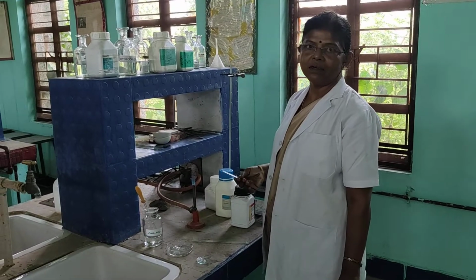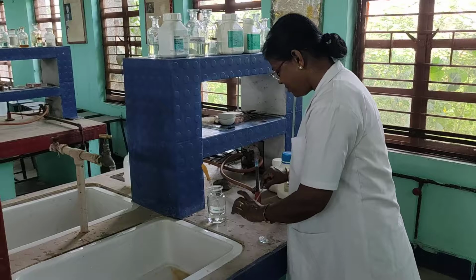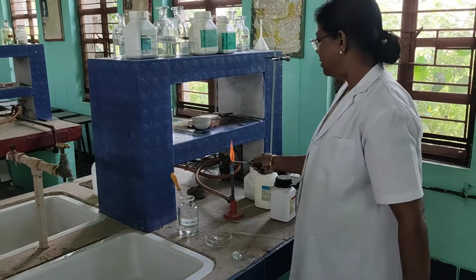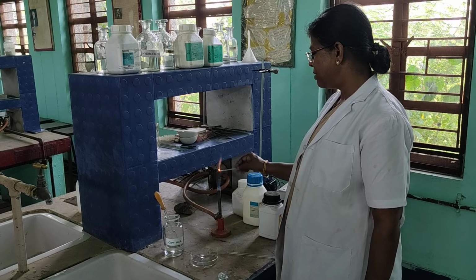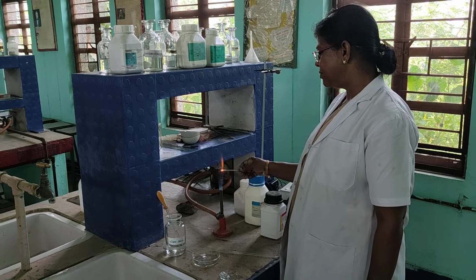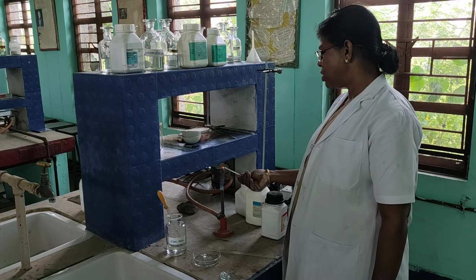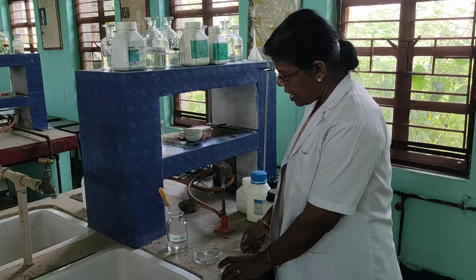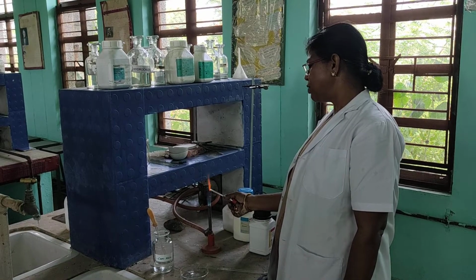White color due to the presence of the lead ions. Now what I have done is, I have first cleaned my platinum loop thoroughly so that it won't give any color. Now it is not giving any color. Then I will dip it in this and show it to the Bunsen flame. Initially it may be giving color like this, and you will mistake it.